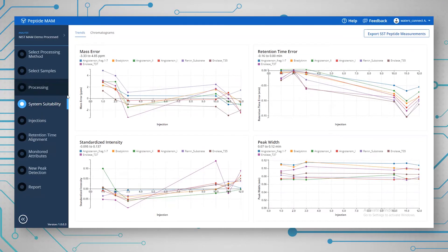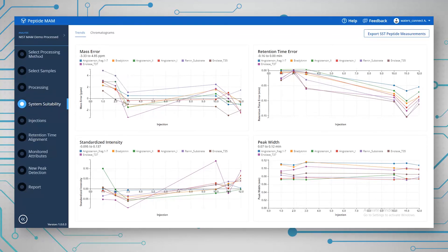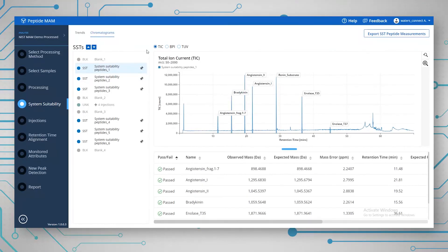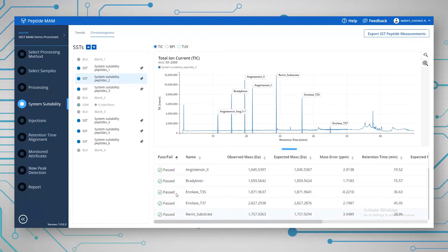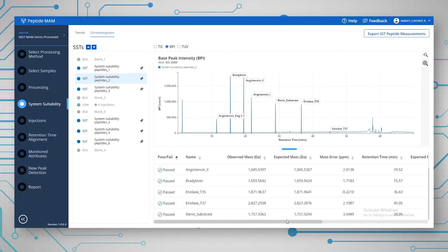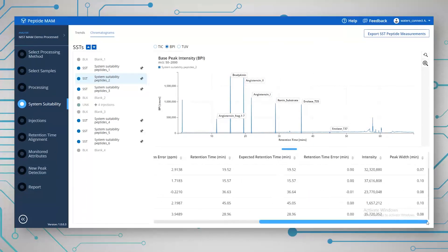The first thing you will see after processing is the data from the system suitability test. It's plotted the injections according to things like mass error, retention time error, standardized intensity, and peak width — giving a nice visual overview of your SSTs, including the chromatogram view. Everything has passed here — we have the six SST samples, and you can click on any of them. If anything had failed based on the criteria set up in the method, it would appear as a red cross, so you would know instantly if something had failed. You can also look at the TIC and the BPI, as well as checking all the pass-fail criteria.